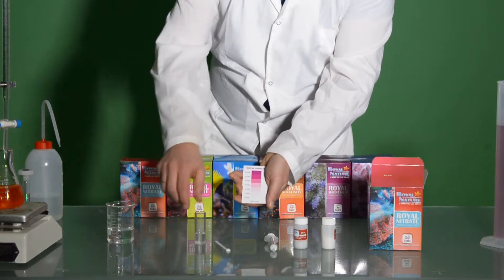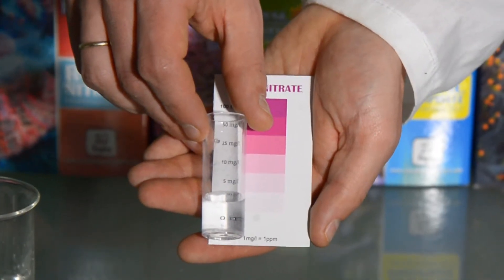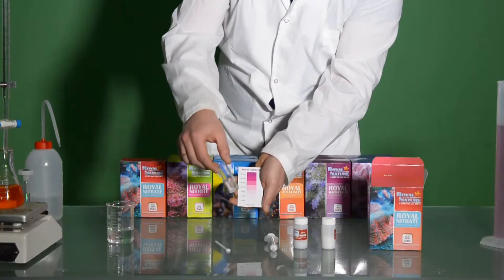We can clearly see that the fresh mix of Royal Nature salt is very white and it corresponds to zero ppm of nitrate.